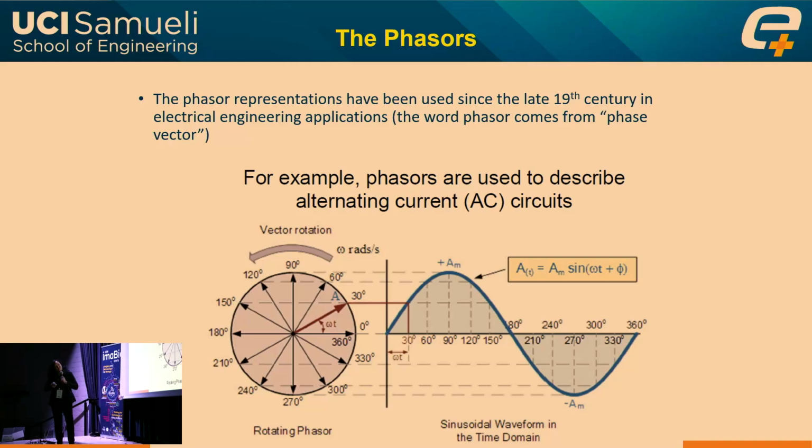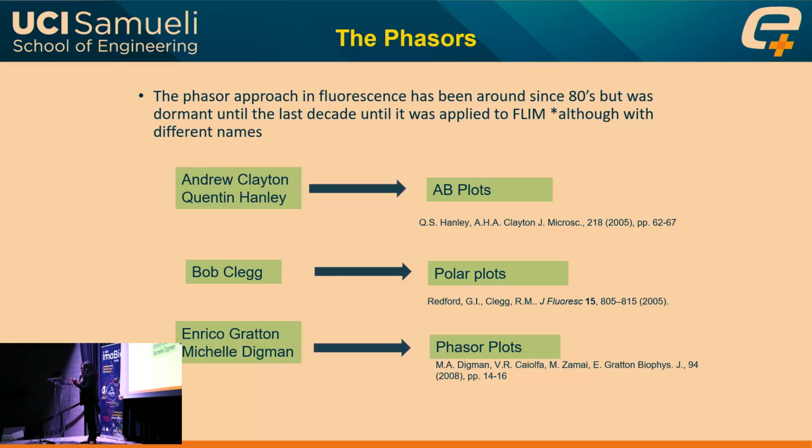As you can see here, we have a vector that rotates along this axis, and the length of the vector can be defined by the change of amplitude, and then we have this phase shift, which, if you're looking at frequency space, if there's a shift in phase, will give rise to the angle of the vector change.